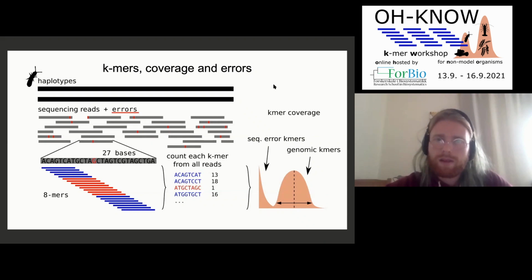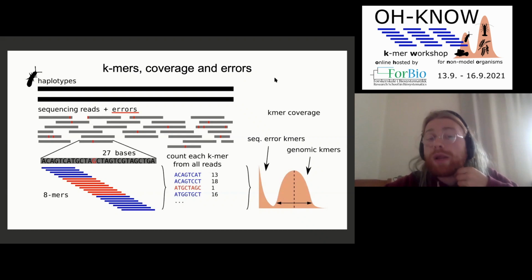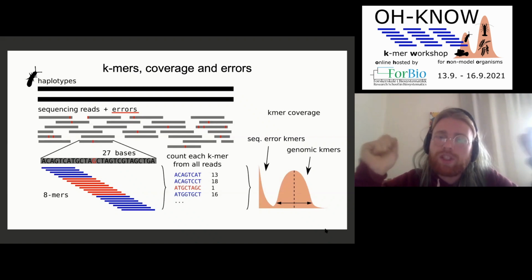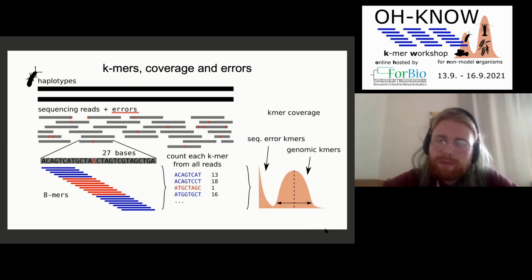I'm just trying to understand the error detection as well, and I'm wondering: is there an inherent property in different genomes where you only see certain Kmers? If you took a Kmer of 18, you don't get a particularly even distribution of Kmers that can occur. Some of them are just impossible. Which is why the errors are rare. Yes, that's kind of the point. Well, not impossible, but there is a finite amount of real Kmers in the genome, which should be a lot lower than the number of possible Kmers. How much does that vary based on organism, which Kmers can be present?